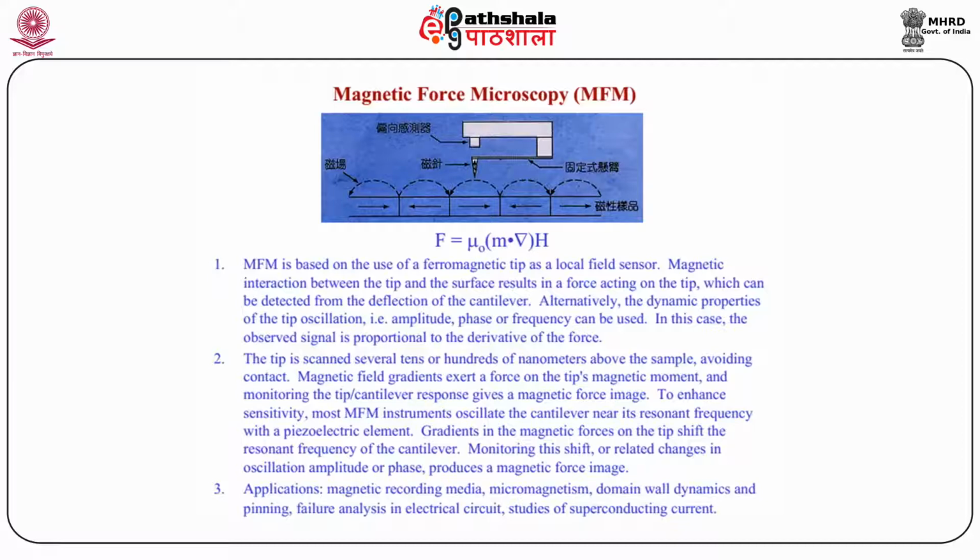Gradients in the magnetic forces on the tip shift the resonant frequency of the cantilever. Monitoring the shift or related changes in oscillation amplitude or phase produces a magnetic force image.